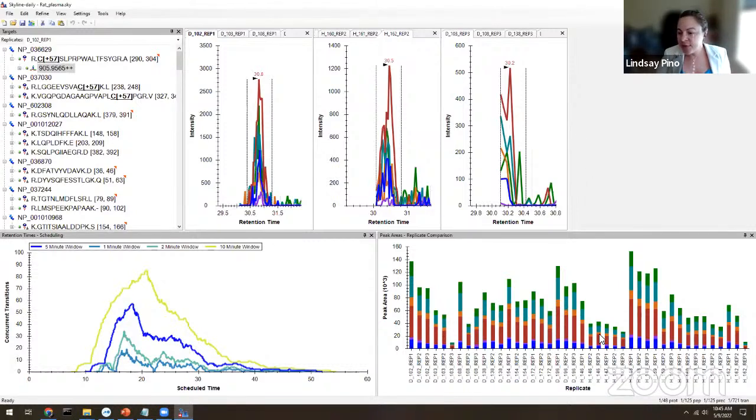Another piece of orientation, down on the bottom right, below the replicate screen, there's a count: 1 out of 48 proteins, 1 out of 125 peptides, precursors, transitions. This is a nice way to get a quick overview of what's in your Skyline document.